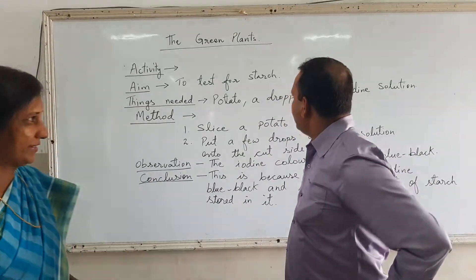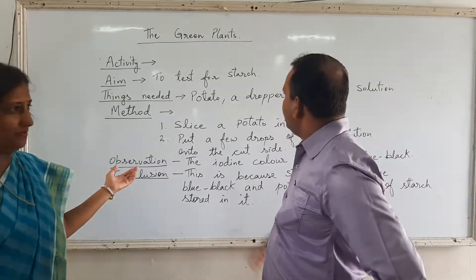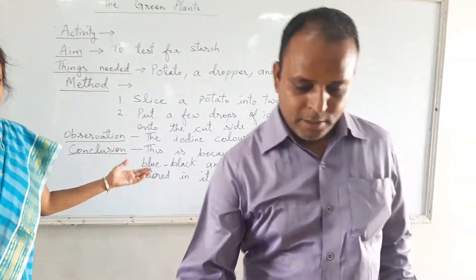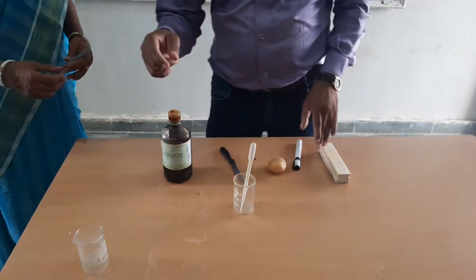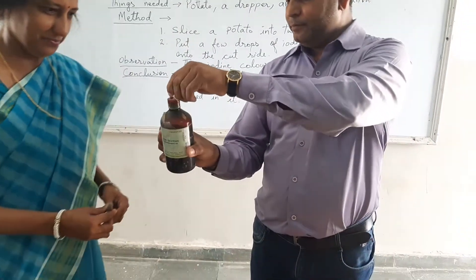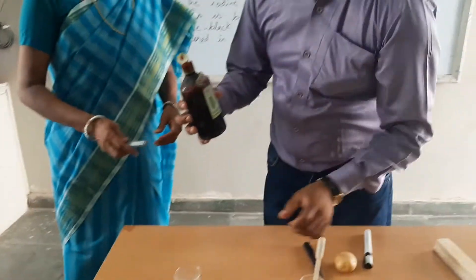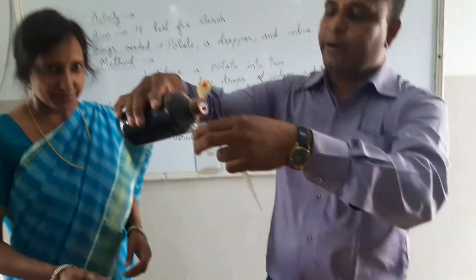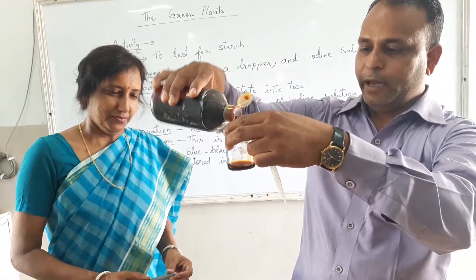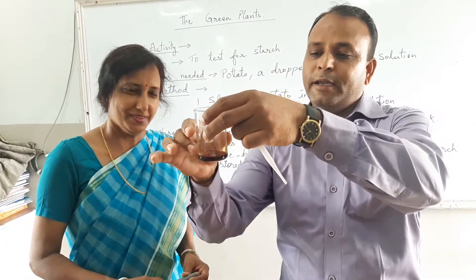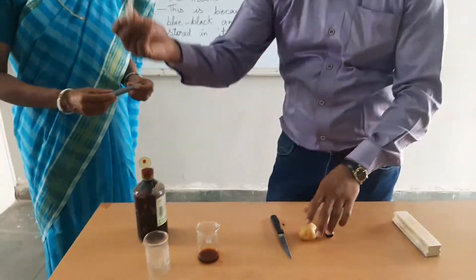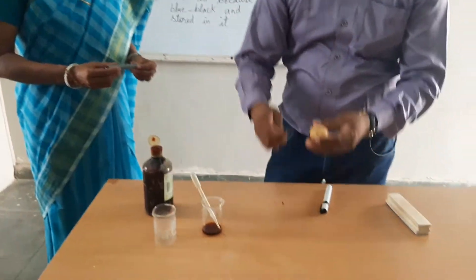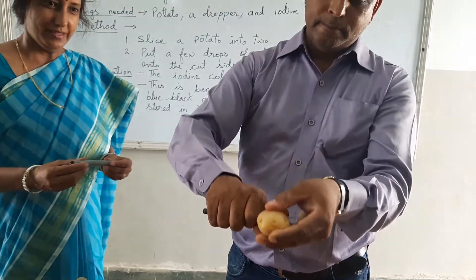The activity involves potato and starch. So let's see. This is iodine solution — take iodine solution in a beaker. The iodine color is brown-yellow. This is the dropper.